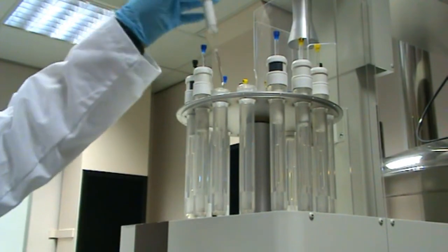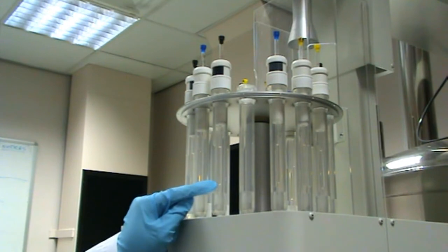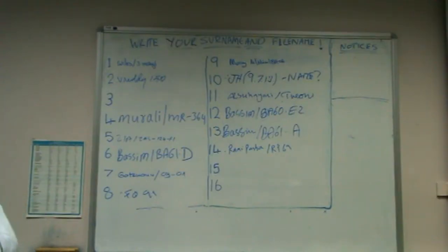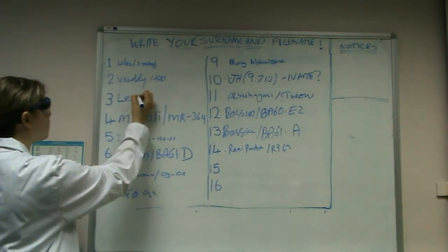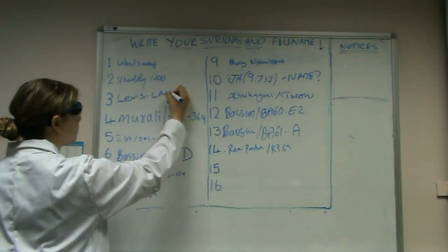Before the tube is inserted into the machine, an empty space must be found out of the 16 spaces available, not only on the machine carousel but on the corresponding board. Once a space has been found, your sample can be inserted into the carousel and the appropriate name must be written on the board along with the file number for the experiment.